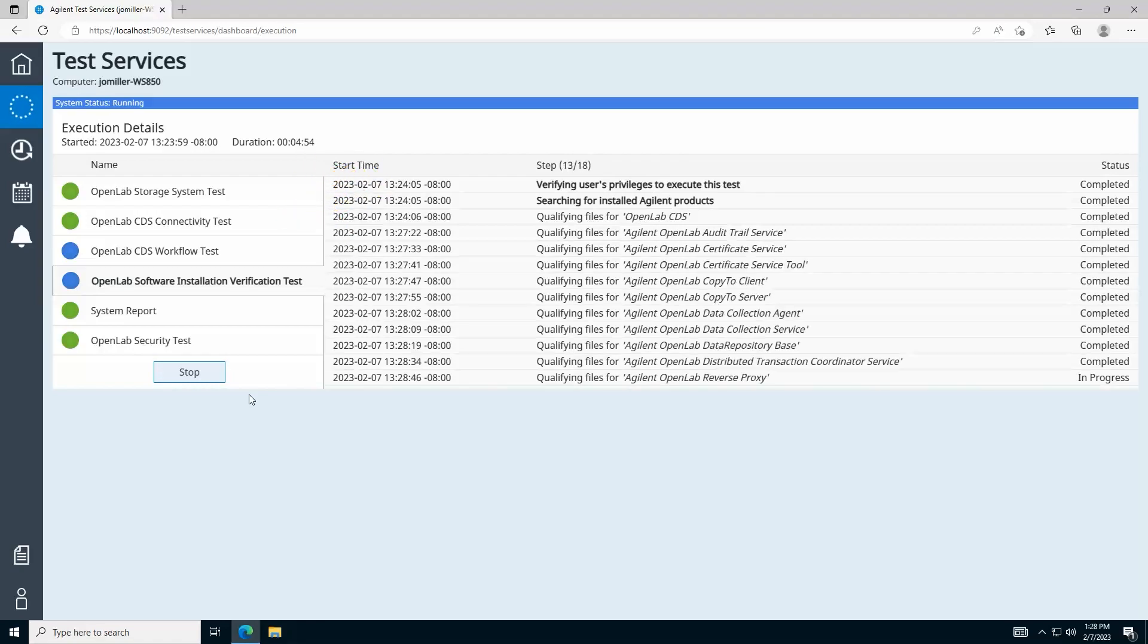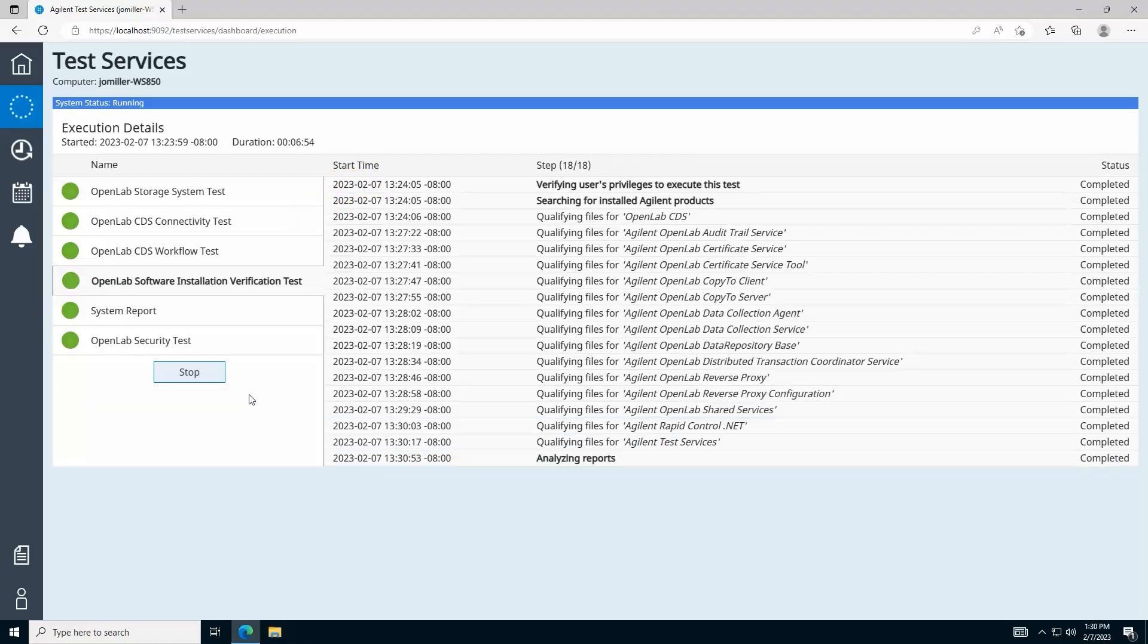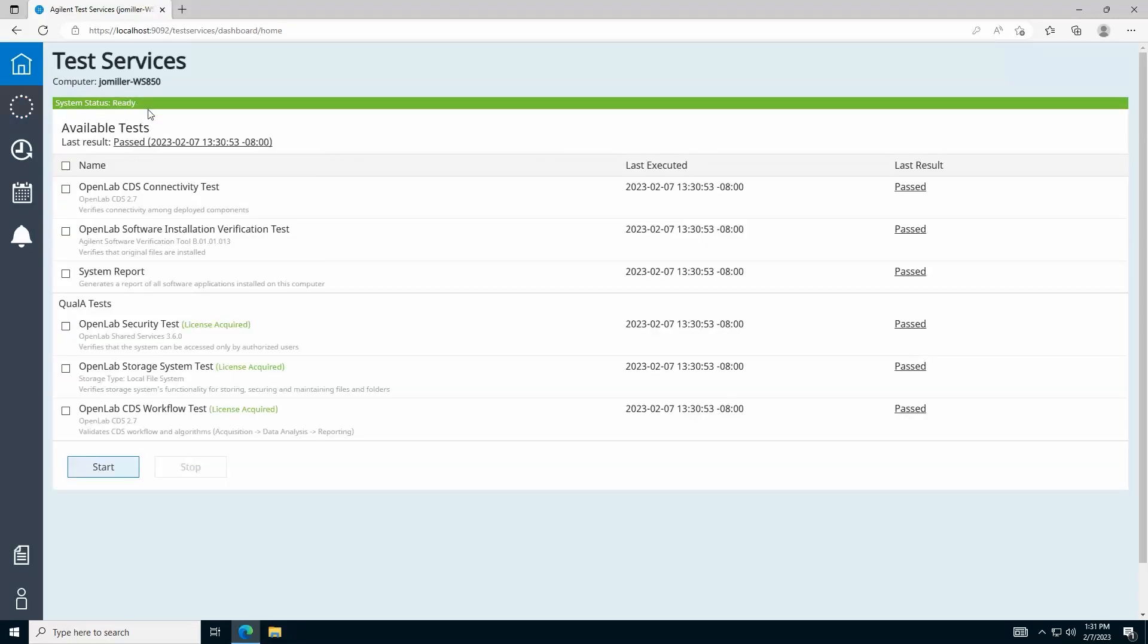When all the tests have completed, an overall test result is reported and can be viewed on the home page or in the Execution History page found here.